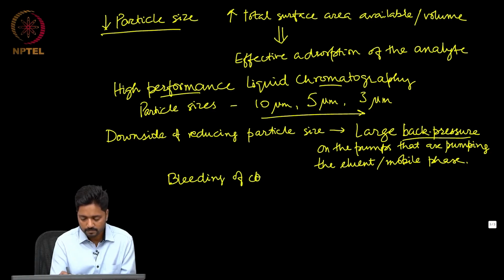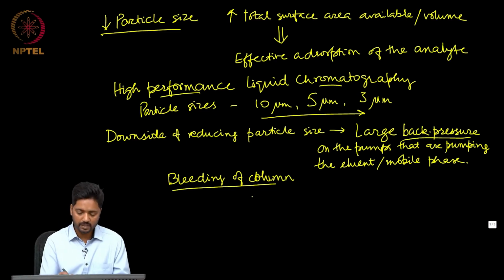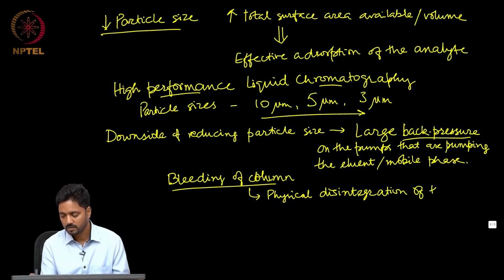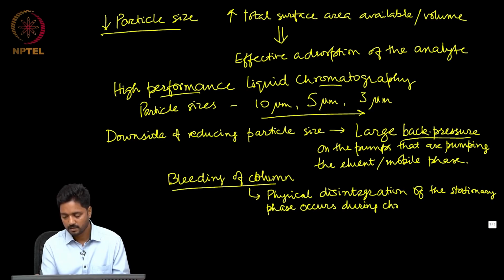bleeding of column. Now, this is where the physical disintegration of the stationary phase occurs during chromatography.